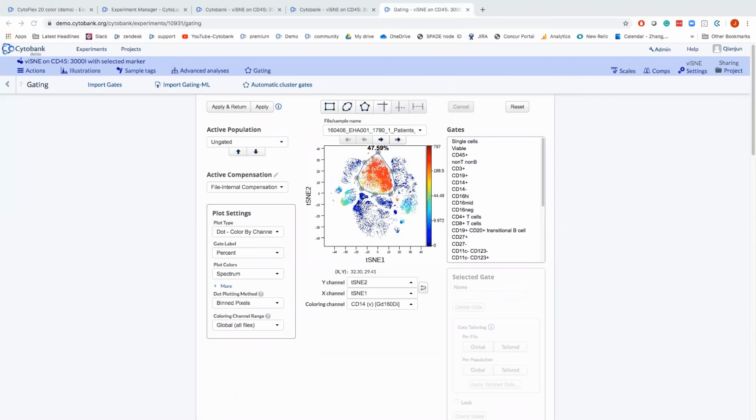Perfect. Okay, more technical questions. What is KL divergence, and which range should it be? Great question. To put it in a simple way, KL divergence is a value you can use to measure the matrices of the high dimensional data versus the matrices of the low dimensional data. The more similar those two are, the lower the KL divergence will be.